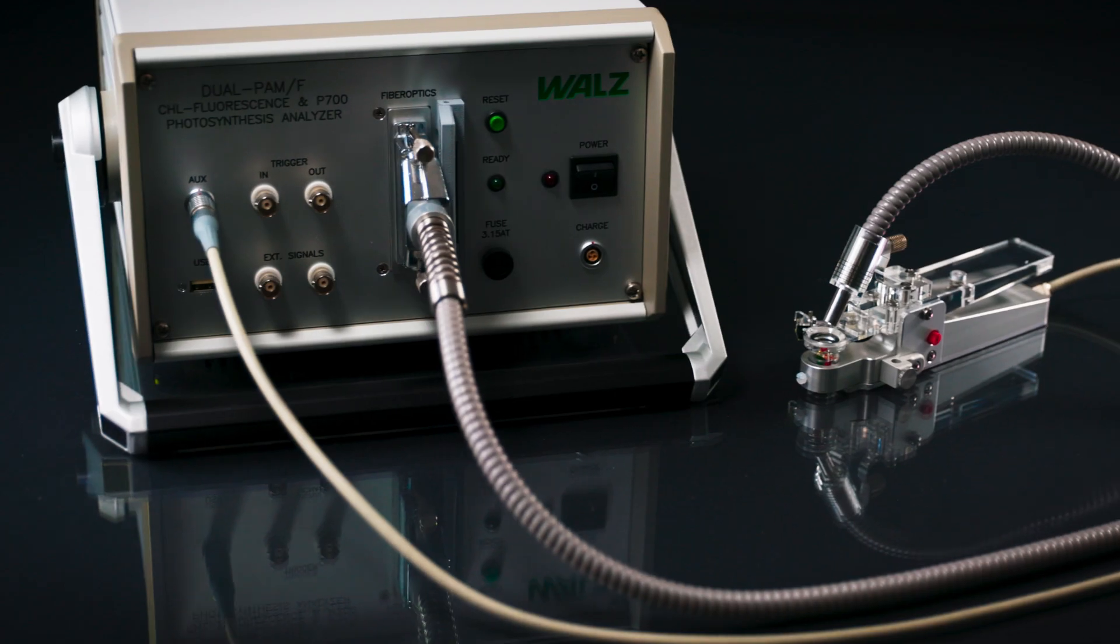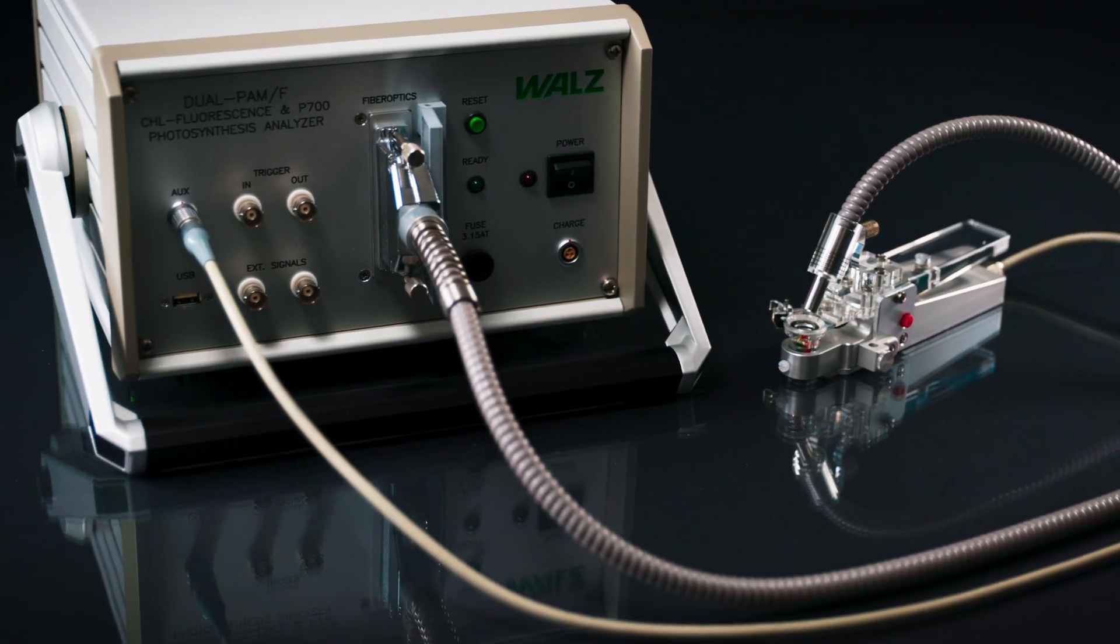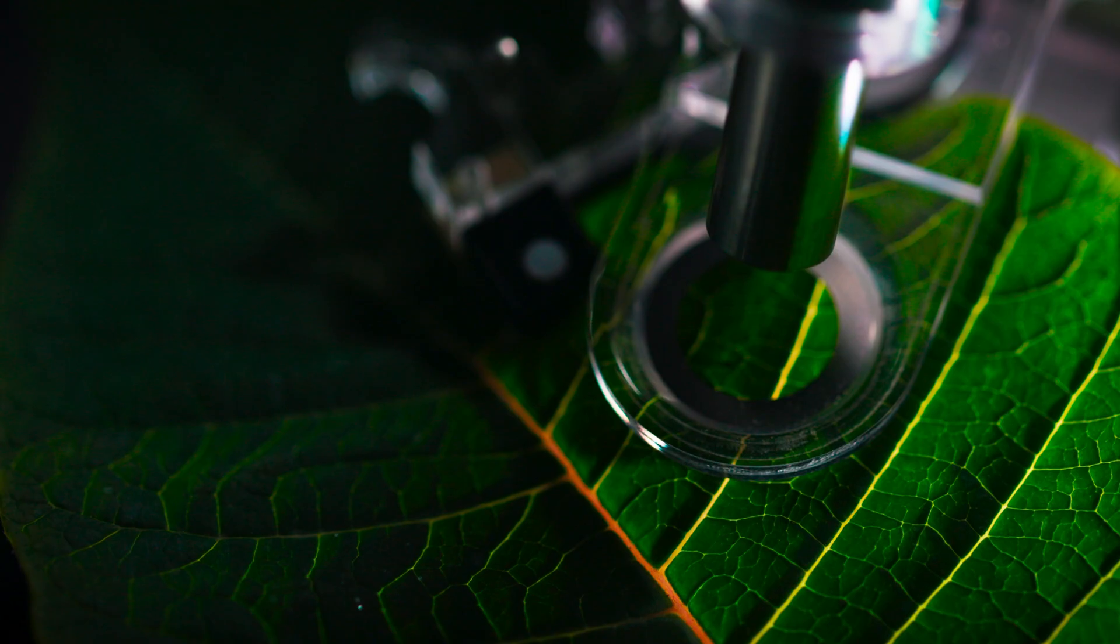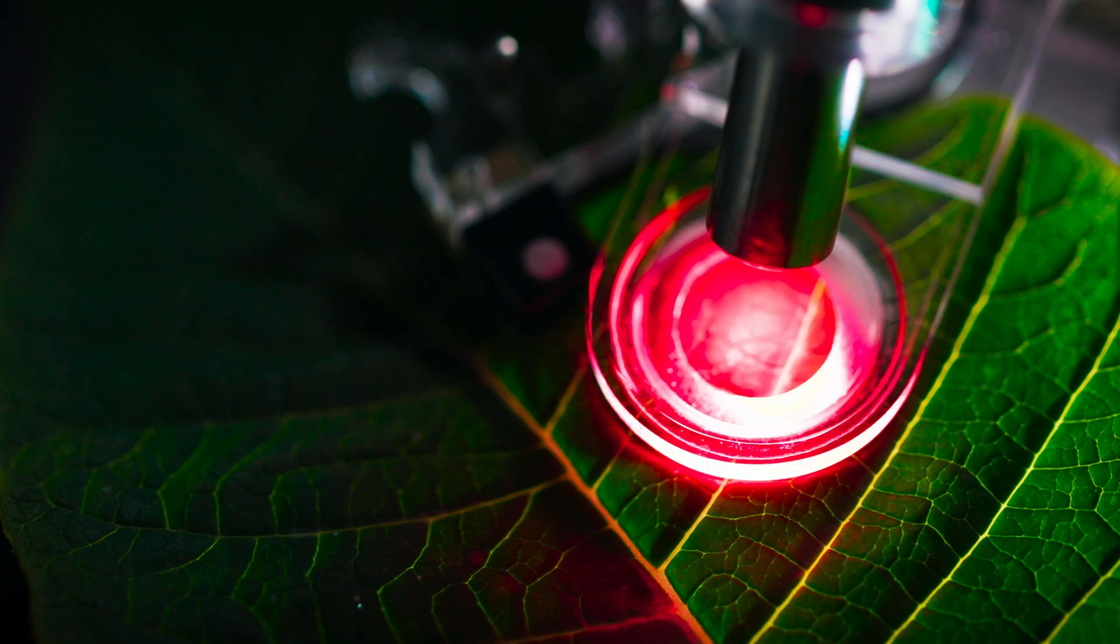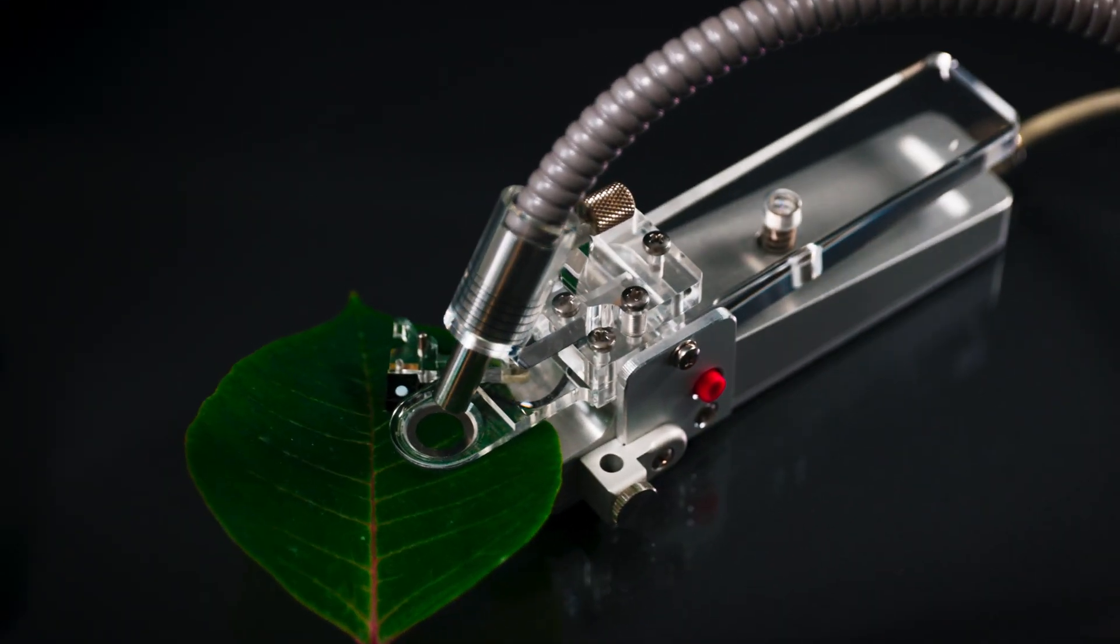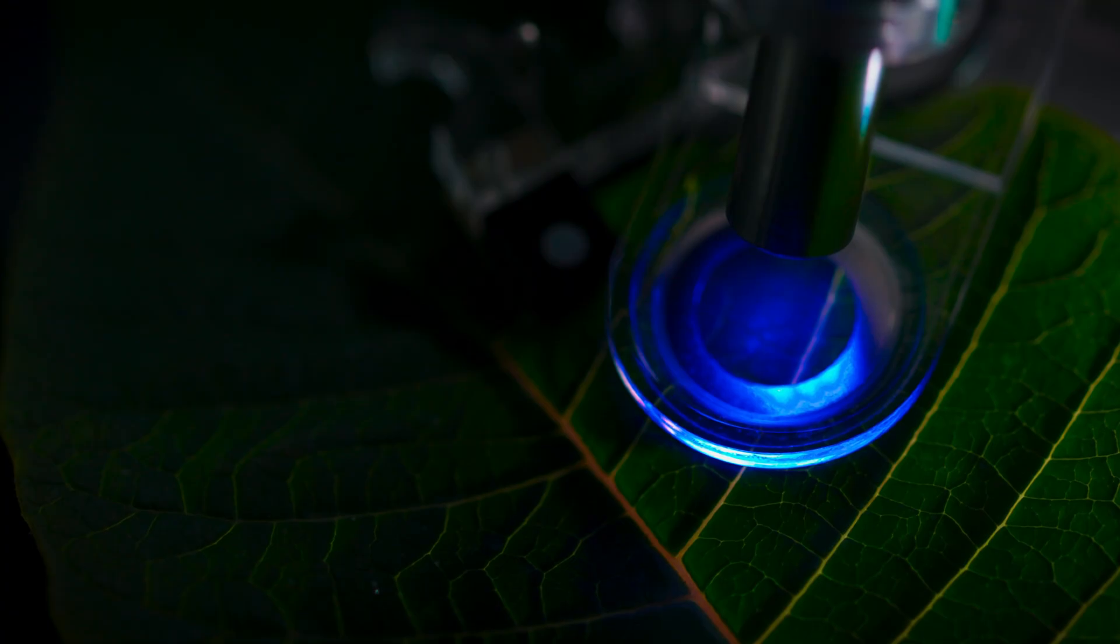Dual PAM systems apply saturation pulse analysis and pulse amplitude modulated fluorescence, abbreviated PAM fluorescence.